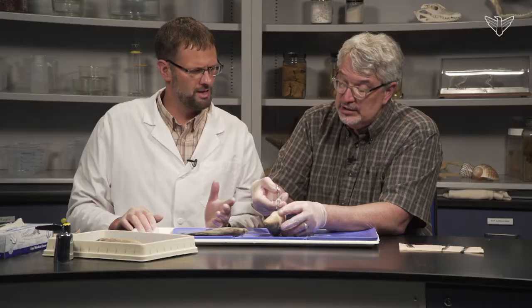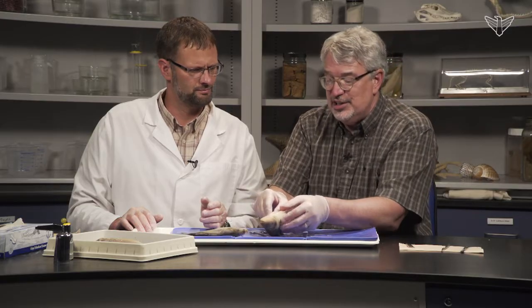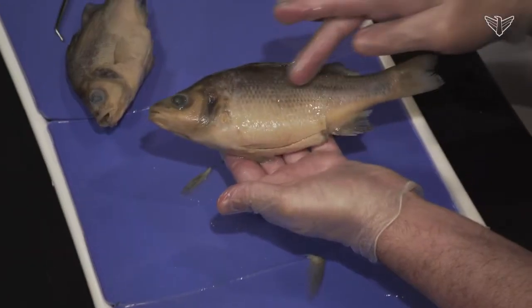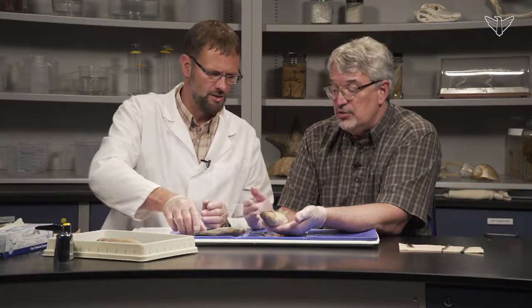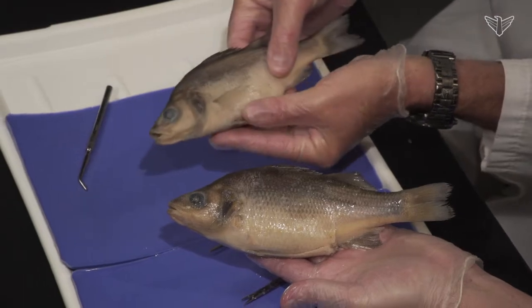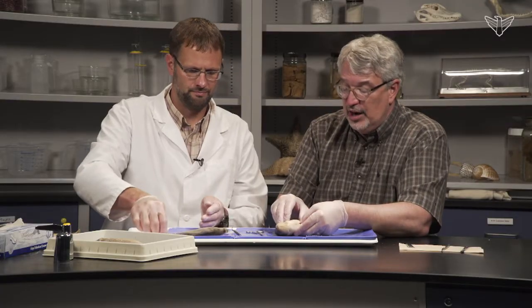We suspected this one was female because her belly is kind of enlarged, and usually the eggs and the ovaries are larger. In comparison to that one, we're expecting that other one to be a male, but externally there isn't a lot of difference.